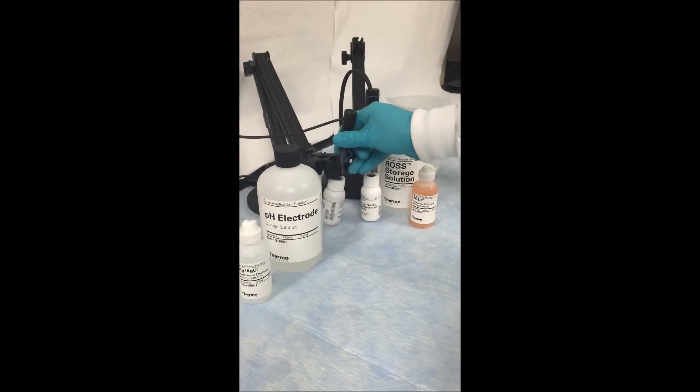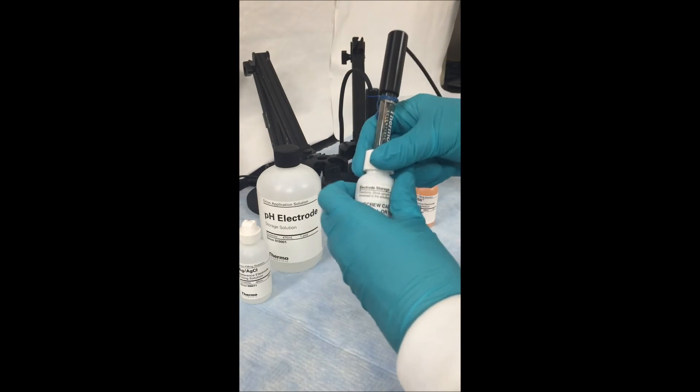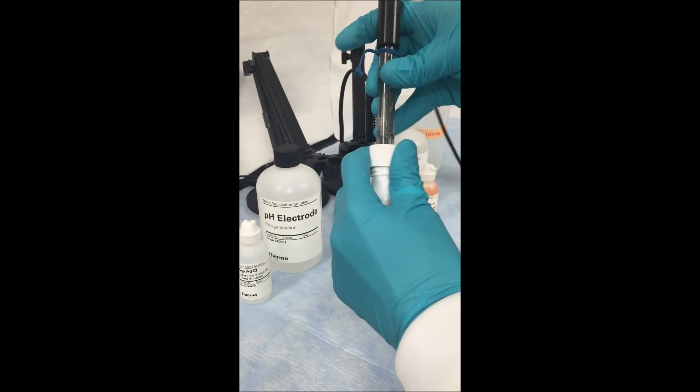The first step every day when you go into the lab is to start by removing your electrode from the storage solution bottle. To remove the electrode, first unscrew the cap of the bottle and slowly remove the electrode so as not to create a vacuum.